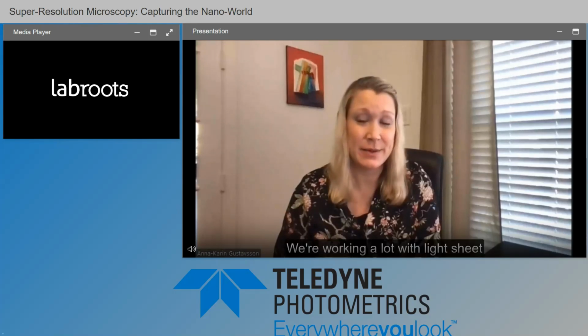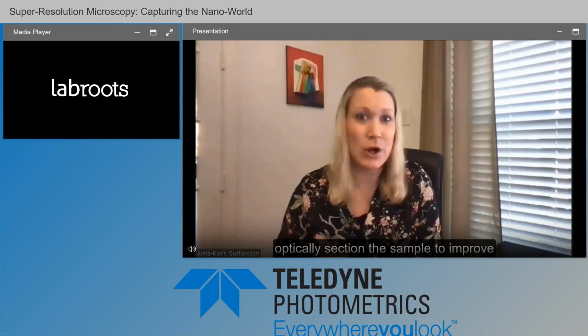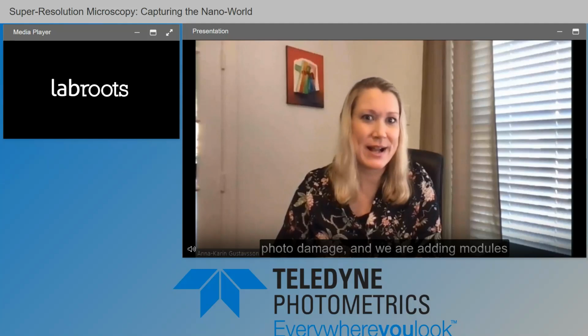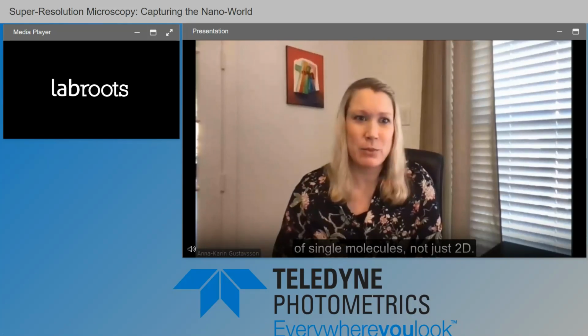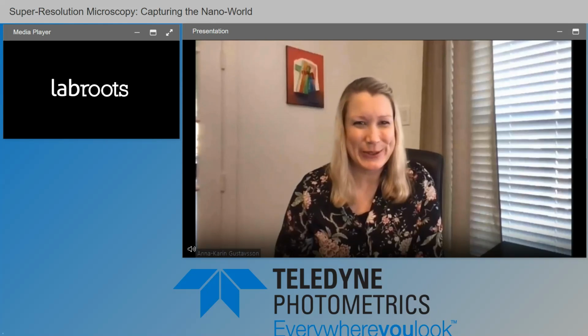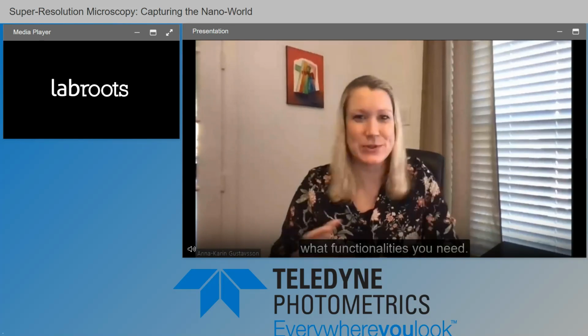So we're working a lot with light sheet illumination, which is a way to optically section the sample to improve fluorescence background, photobleaching, photodamage. We are adding modules to be able to extract 3D position of single molecules and not just 2D. So I like to see it as a modular kind of development where you can add different modules depending on what functionalities you need.